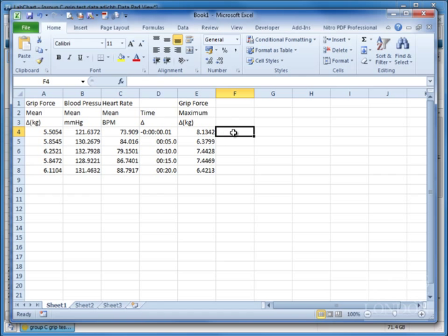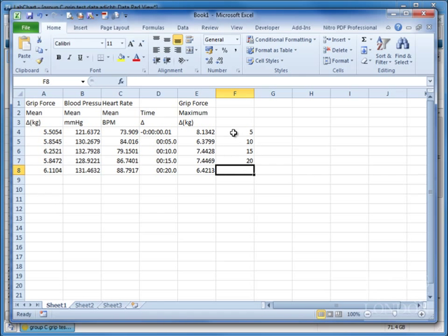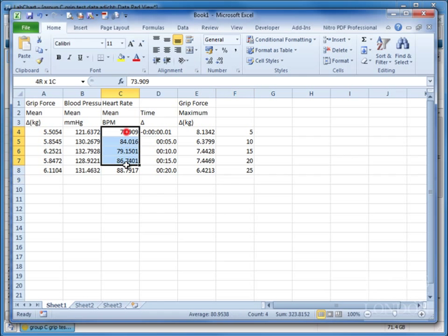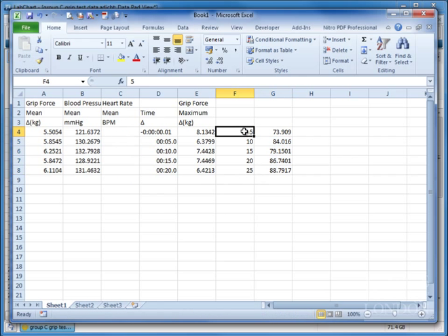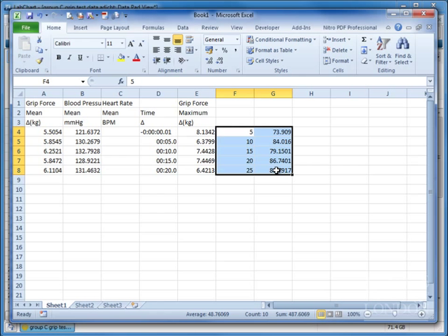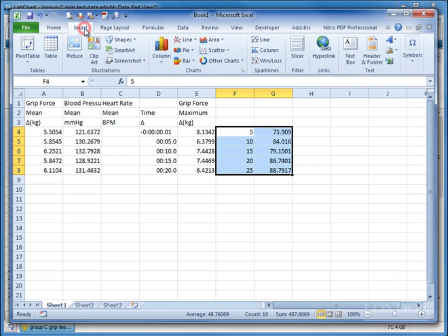add a legend here. So this is 5, 10, 15, 20, and 25. We could copy these data to this point, and we could plot ourselves, very simply, a little graph just to see what the changes in heart rate are.